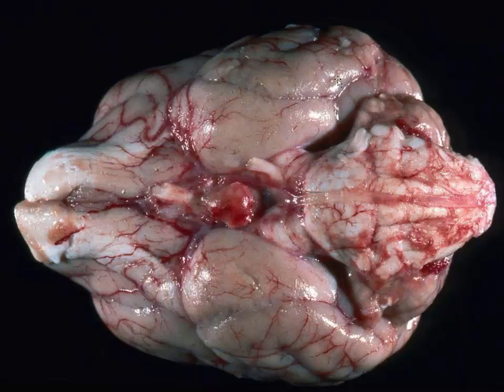Okay, so if you took a look, people often say, here's a little bit of fibrosis up here, a little meningeal fibrosis, a little bit right here. Remember we talked about that before, how the cell sizes tend to get a little bigger in older dogs. But what I wanted you to see, and probably a lot of you didn't pick up on this initially, is there's one optic nerve here. Only one on one side.